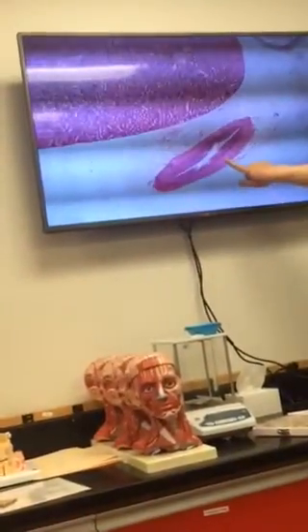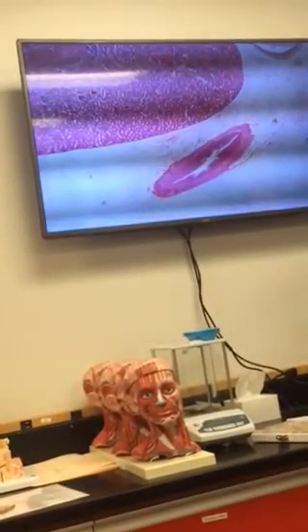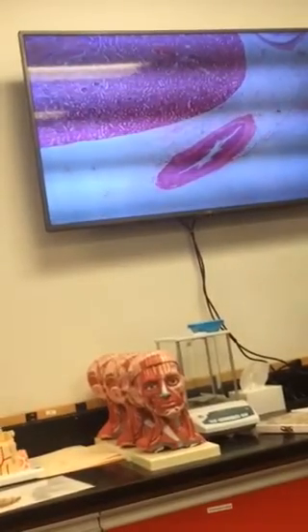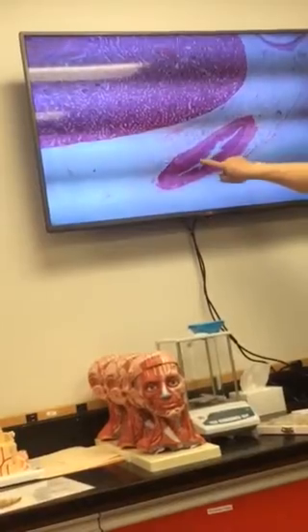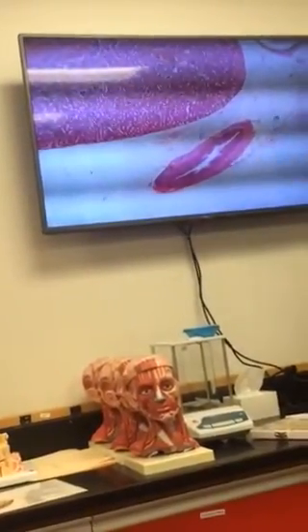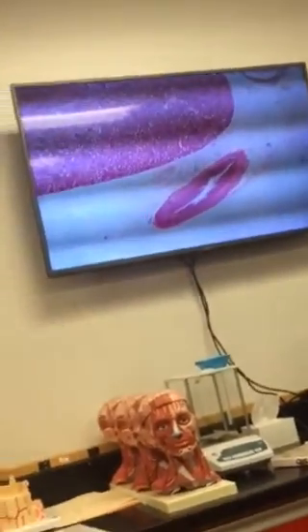And then, well, I'll be darned. You know what that is? You know what that is? That's a ureter. And you can see the transitional epithelia lining the inside. That's all transitional epithelia there. So they actually managed to get us a little section through a piece of ureter. Well, I think it's neat.